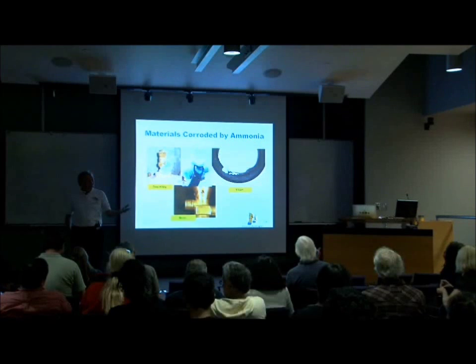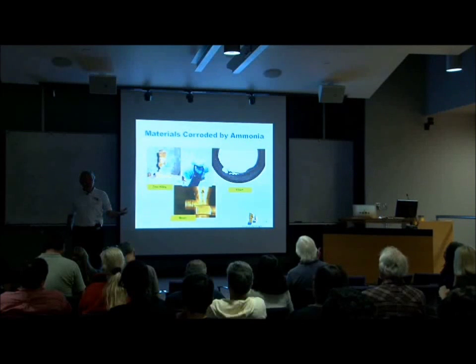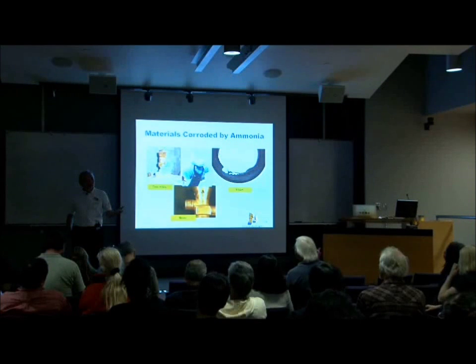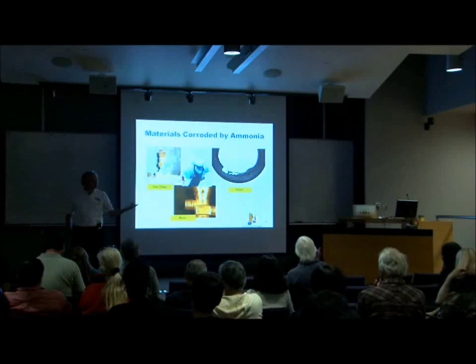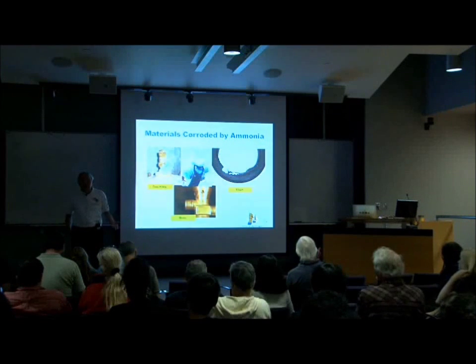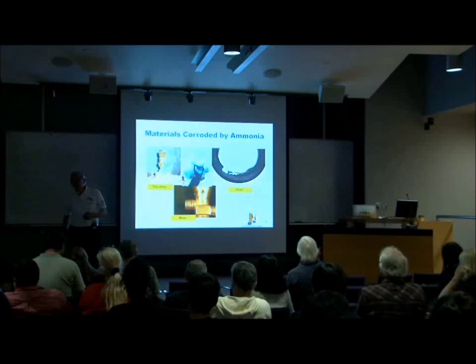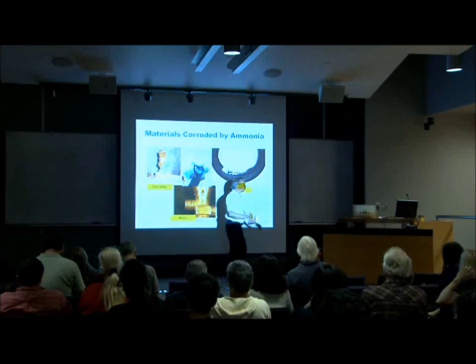For example, what's the basic rule when you're handling acetylene? What is the worst thing you can use? Copper. You'll make copper acetylides, which are explosive. So the basic safety rule when you're handling acetylene is you don't use any copper compound, right? Ammonia, anything related to zinc. It becomes embrittled as a result of the ammonia.